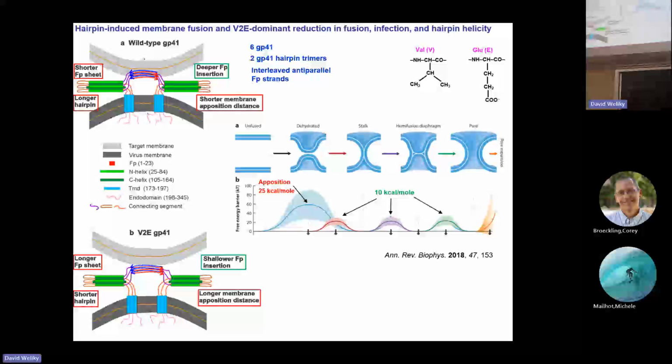Your schematic looks like the peptides are packed closely. What is the relative surface density of the peptide? Typically, we would have something like 100 lipid molecules for every peptide. It is absolutely true that a single vesicle probably has 100,000 lipid molecules, so they will certainly have multiple beta sheets.